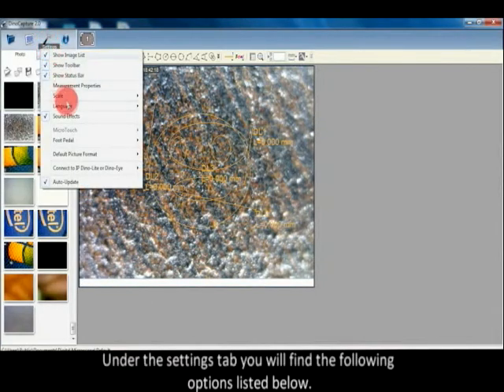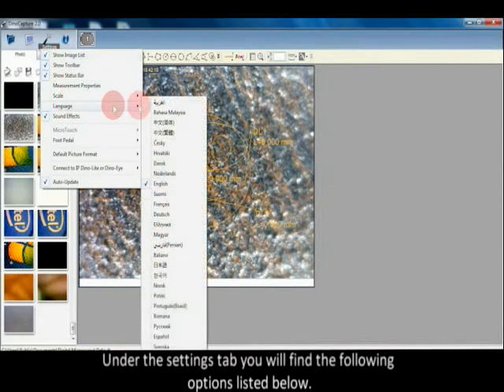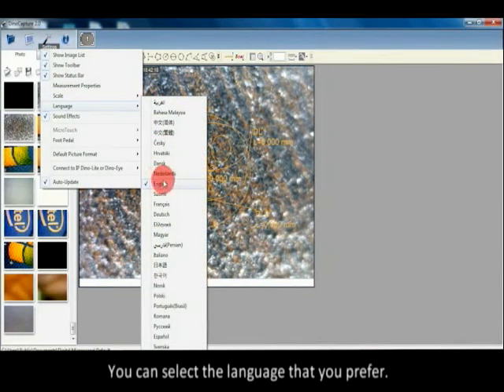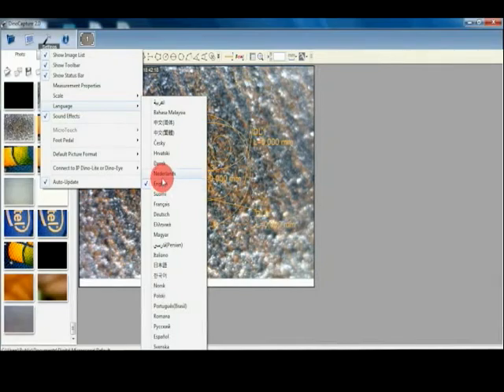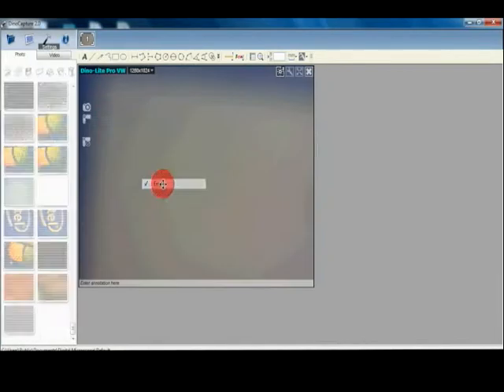Under the settings tab you will find the following options listed below. You can select the language that you prefer.